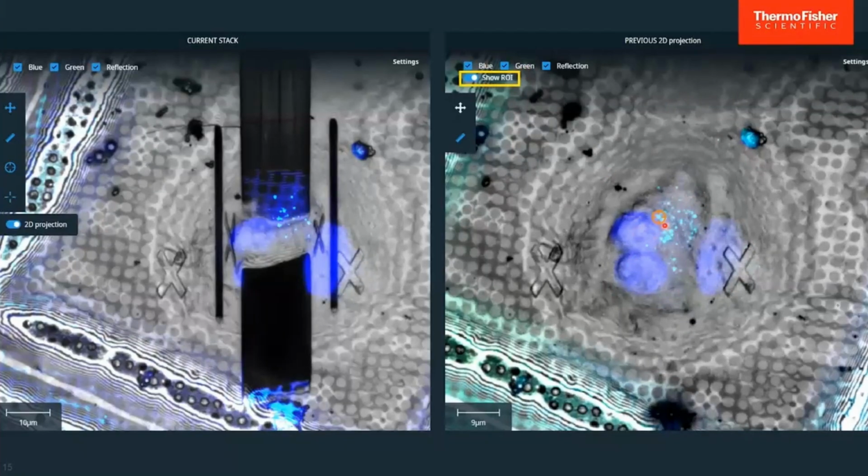In blue you can see nicely the nuclei, in green some mitochondria which are labeled here. And we have implemented the targeting workflow where you can go through Z stacks of the sample taken with the light microscope, define the feature of interest within this 3D Z stack information, and then use that information for targeting the lamella in the automation software.